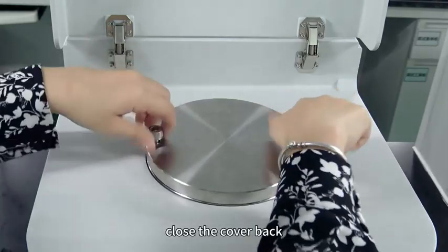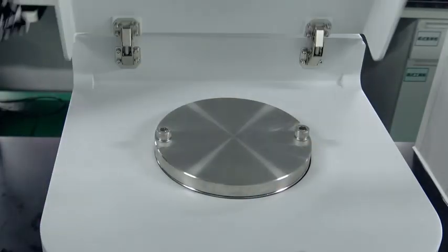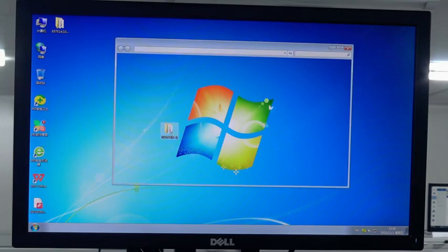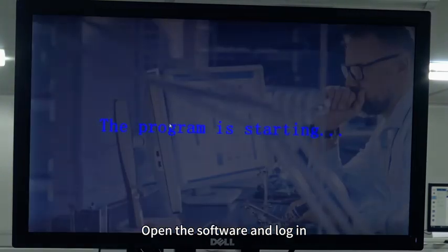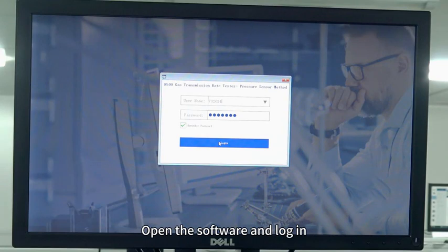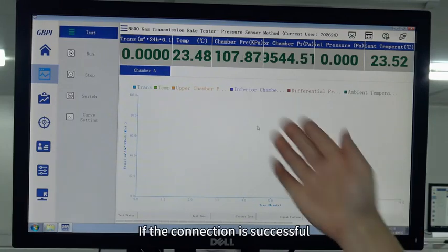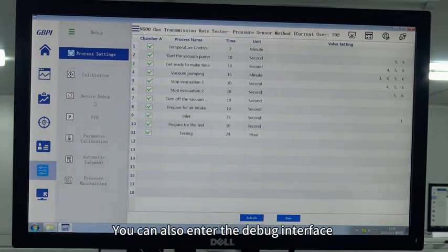Then take out a new aluminum film; the testing surfaces on both sides are the same. Close the cover back. Open the software and login. If the connection is successful, the data here will be displayed. You can also enter the debug interface.